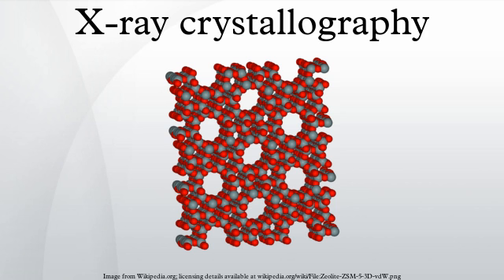In crystals with significant symmetry, even more reflections may have the same intensity. In such cases, even less of the reciprocal space may need to be measured. In favorable cases of high symmetry, sometimes only 90 degrees or even only 45 degrees of data are required to completely explore the reciprocal space.